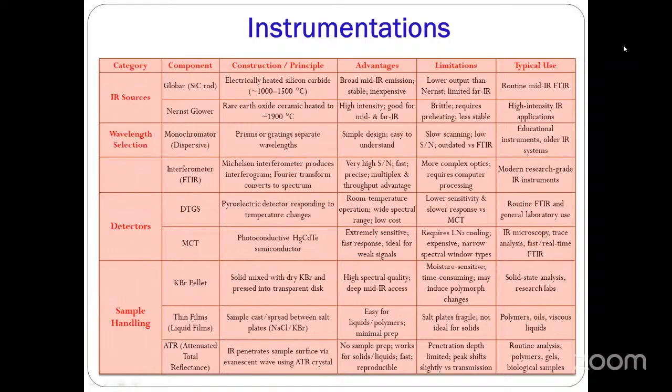So the modern IR instrumentation contains the ATR technique for sample handling. What is the KBR pellet method? Whenever sample analysis is concerned, the solid samples are mixed with dry KBR to form a pellet, which is analyzed by the instrument.